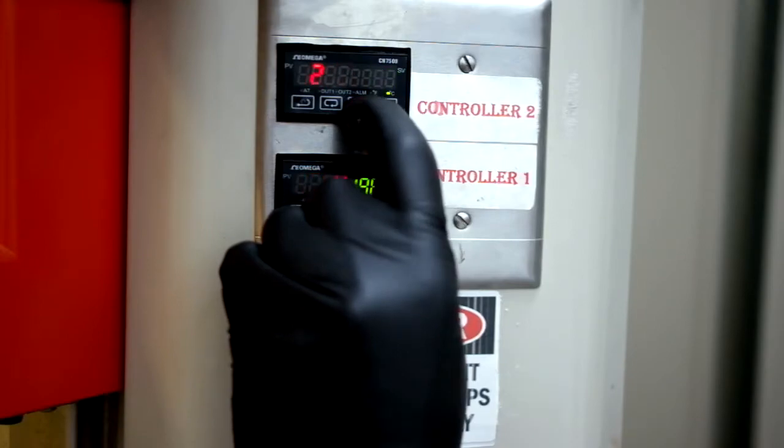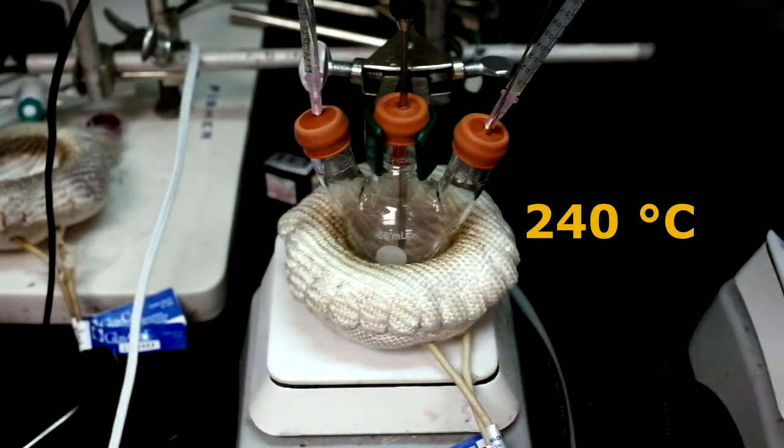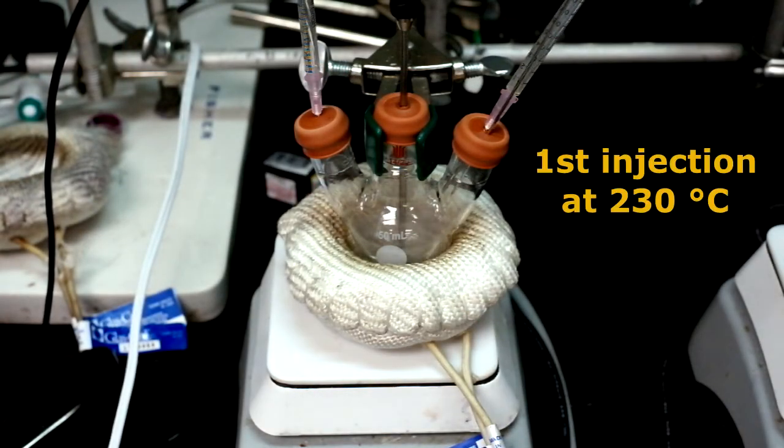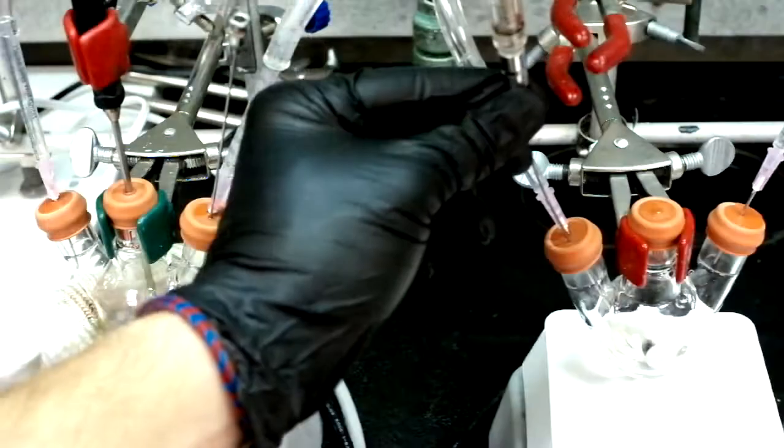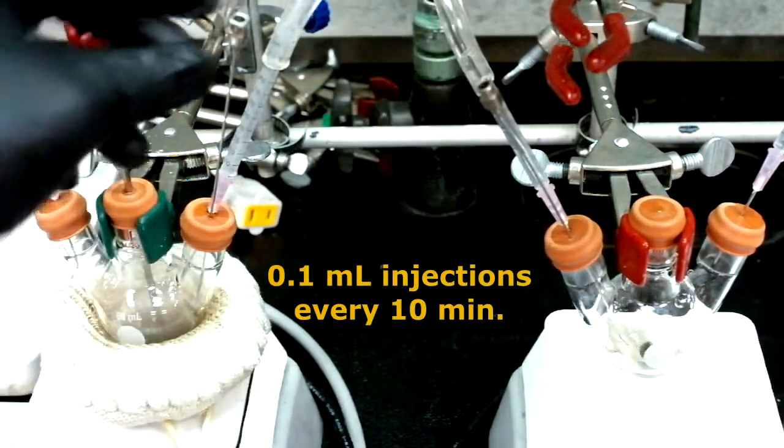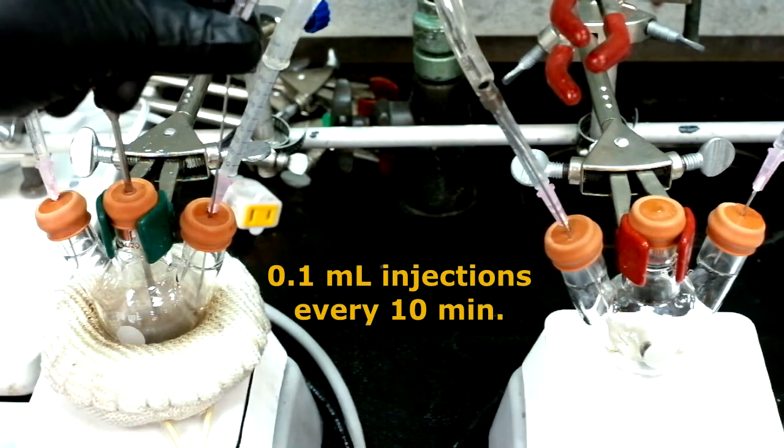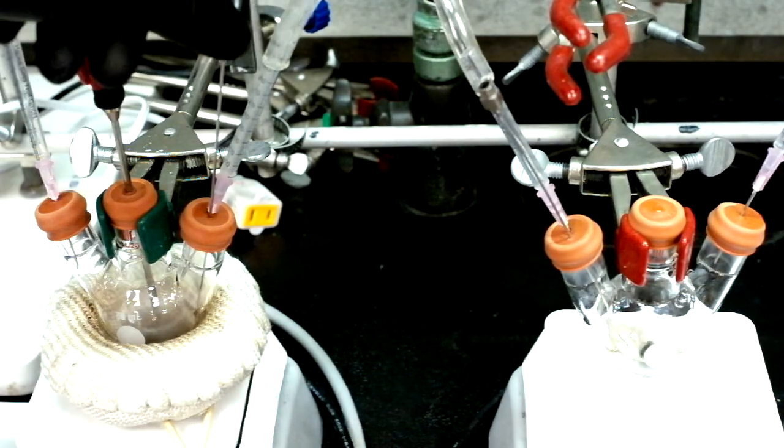Set the temperature of the reaction flask to 240 degrees Celsius, but be aware that the first injection will be done at 230 degrees Celsius. Each injection will be 0.1 ml of the precursor solution and we will do them every 10 minutes after the initial injection.